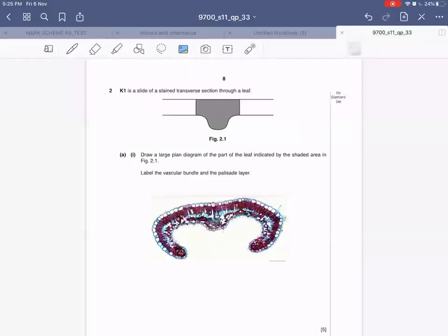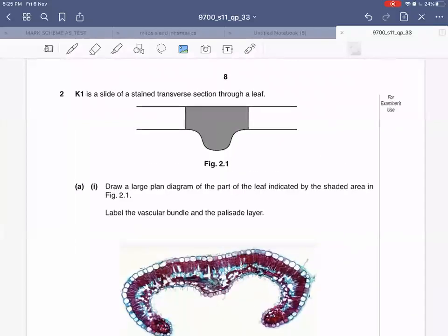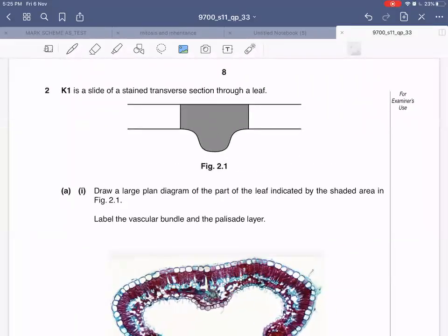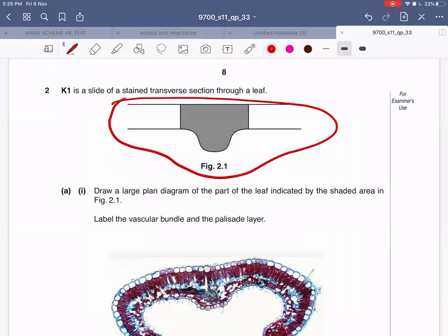The question says K1 is a slide of a stained transverse section through a leaf. Draw a large plan diagram of the part of the leaf indicated by the shaded area in Figure 2.1. The slide given to you will include the entire part, but you are only supposed to draw the large plan diagram of the shaded area. Always read the instructions carefully and then proceed.